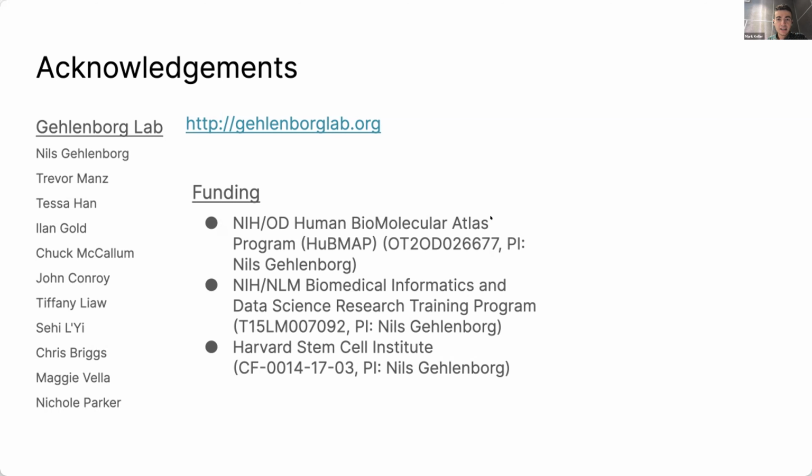I think there's a question from Martha Campbell Thompson. Tissue, was this maybe for a demo? Hi, yes, it was I think the Codex slide you were showing. I didn't hear what the tissue type was. Okay, so for Codex, that was the thymus.